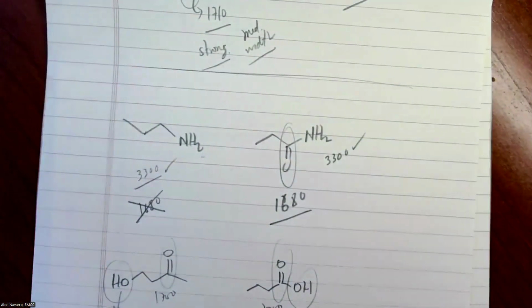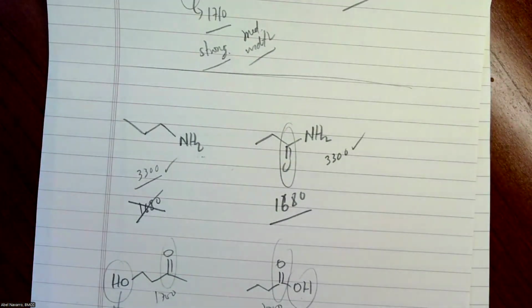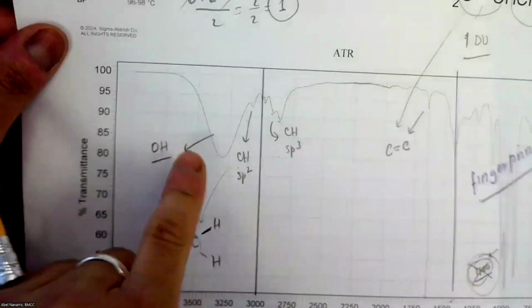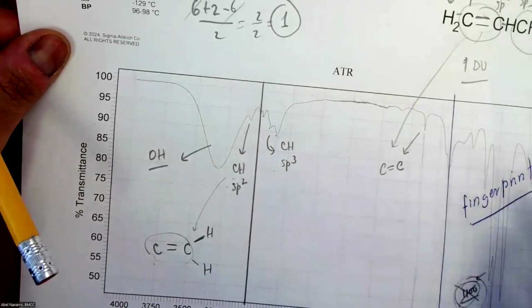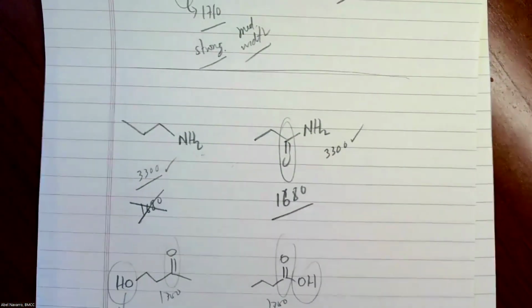In addition, right, to identify the peaks from the spectra. I'll show you the spectra and I tell you, what do you see here? Oh, I see an OH. Oh, I see a CH sp3. Oh, I see a C triple C, right? Things like that. So that's what is expected for this. There is not much more to say or complete.